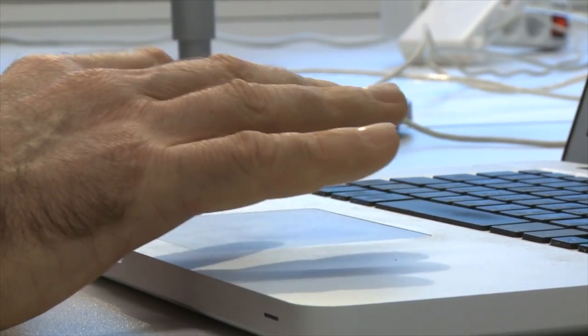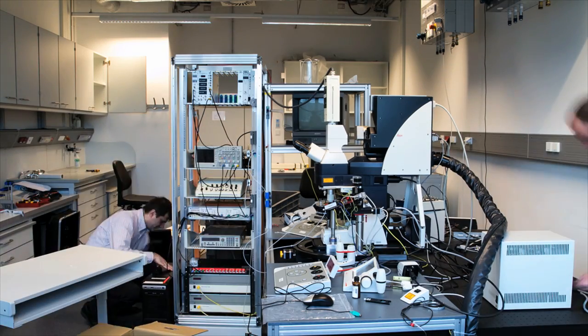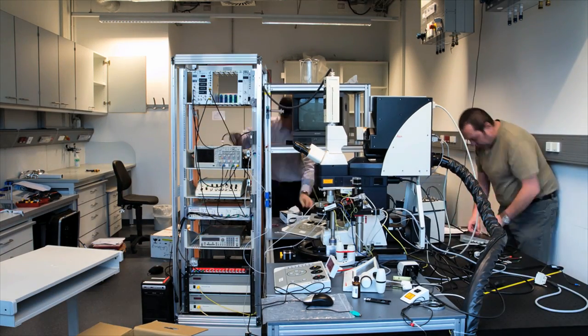These images show one of our combined electrophysiology and imaging setups.